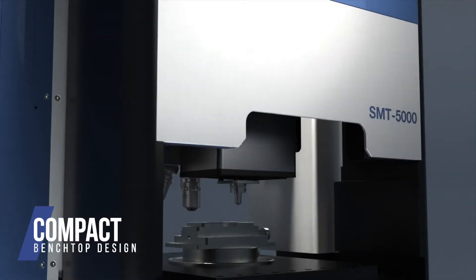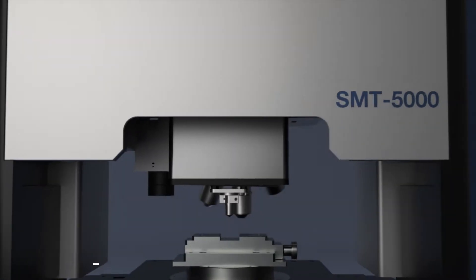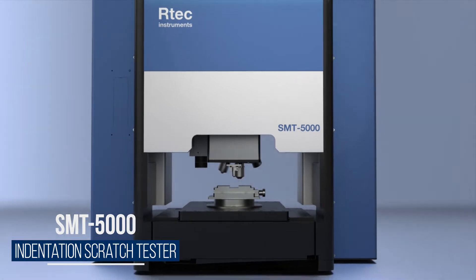A compact benchtop design. An inline 3D optical profilometer. This is the SMT5000.